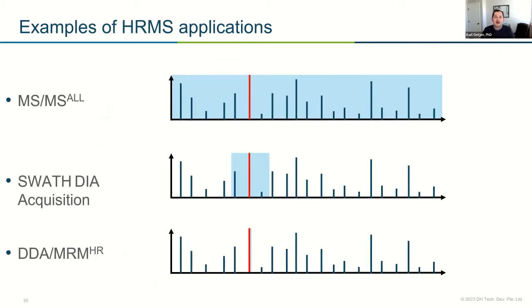But all in all, as a review of what these things are doing, if we were to collect all of the MSMS data, we'd be fragmenting everything at the same time, which is great. You're not going to miss anything. The downside is it's very complicated. You have a lot of overlapping things. Obviously, we saw how many things elute at a certain time. All of that data would be overlapped, and it could be really confusing to work through.